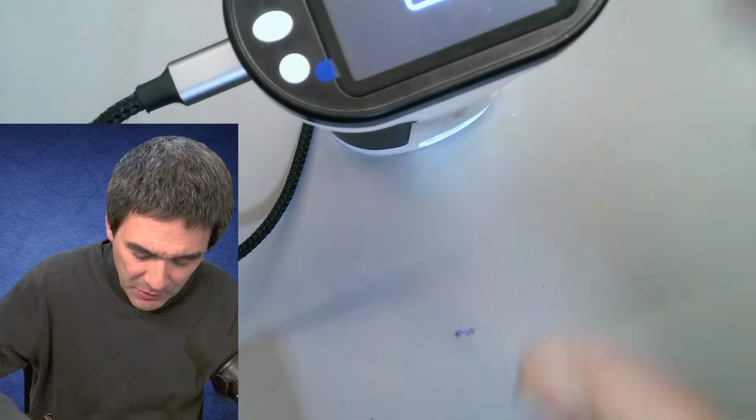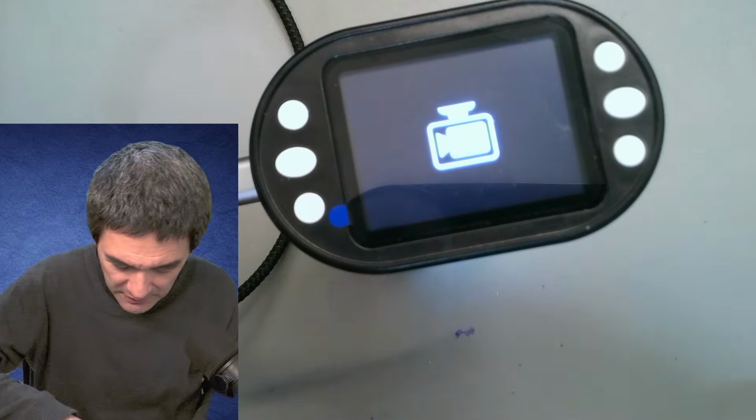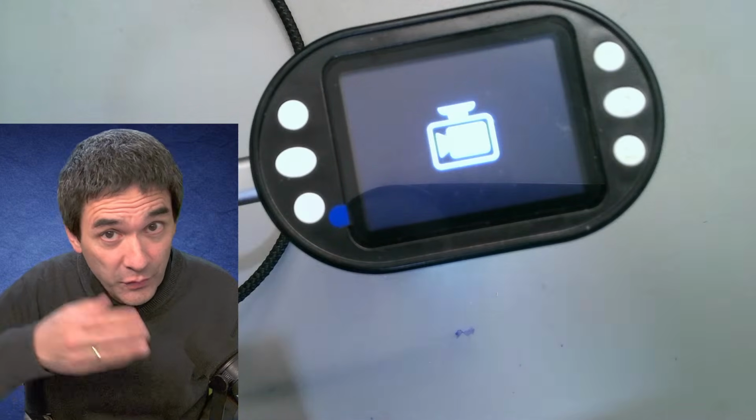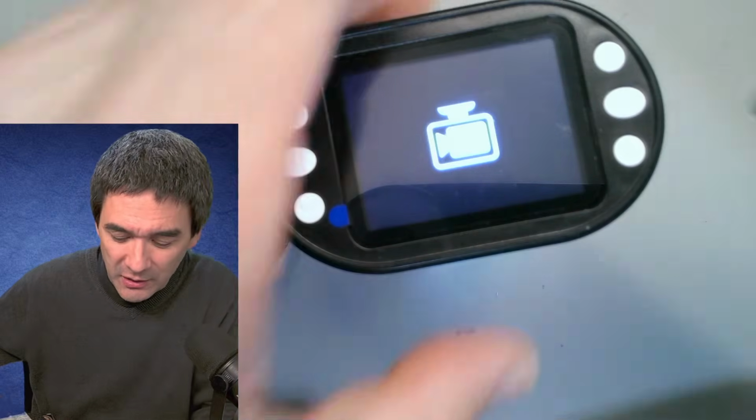One of the reasons why I also bought this is because when I go on holidays and so on, sometimes I just want to observe a little bit of nature, also to record some videos for the channel and so on. And this also came along with it.